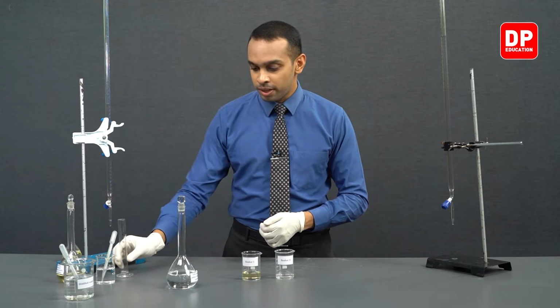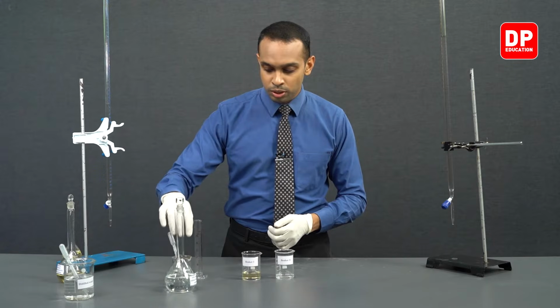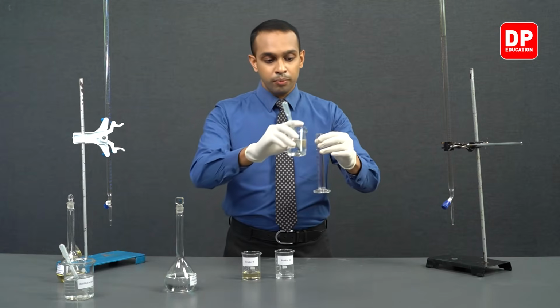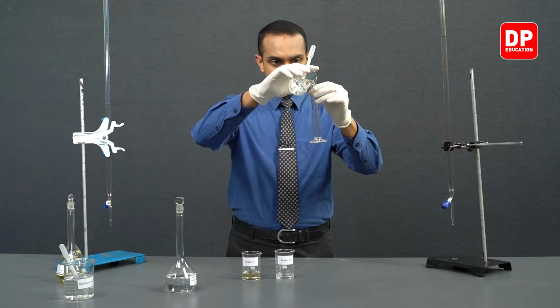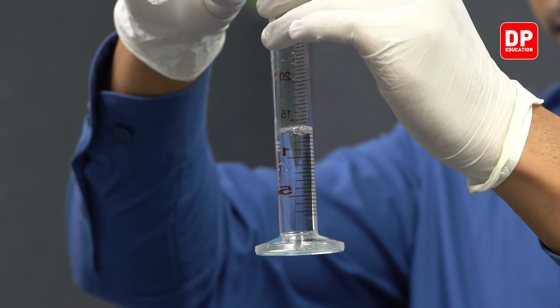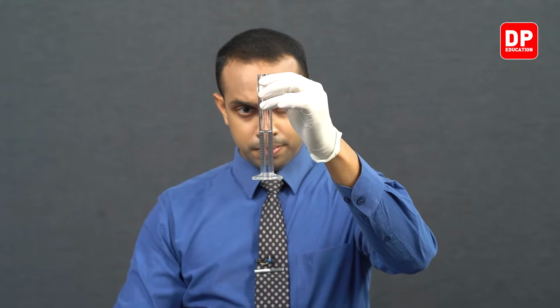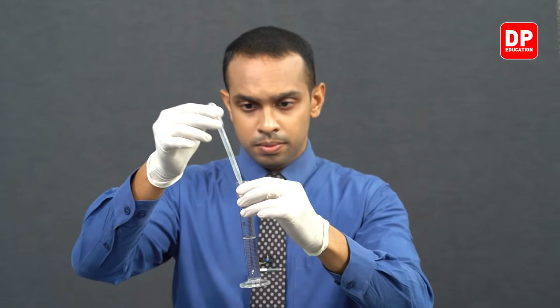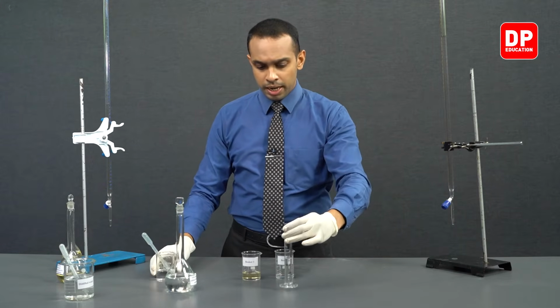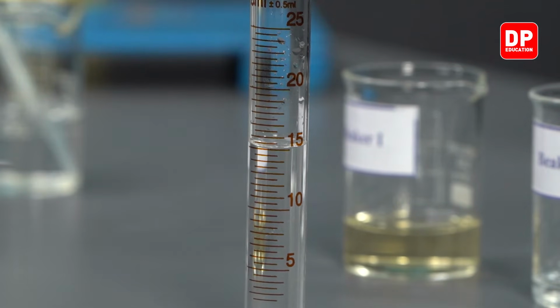After making notice of that, we have our sodium thiosulfate solution taken into this small beaker, and we are going to measure 15 milliliters of this solution. Now, students, we have measured exactly 15 cubic centimeters of sodium thiosulfate.